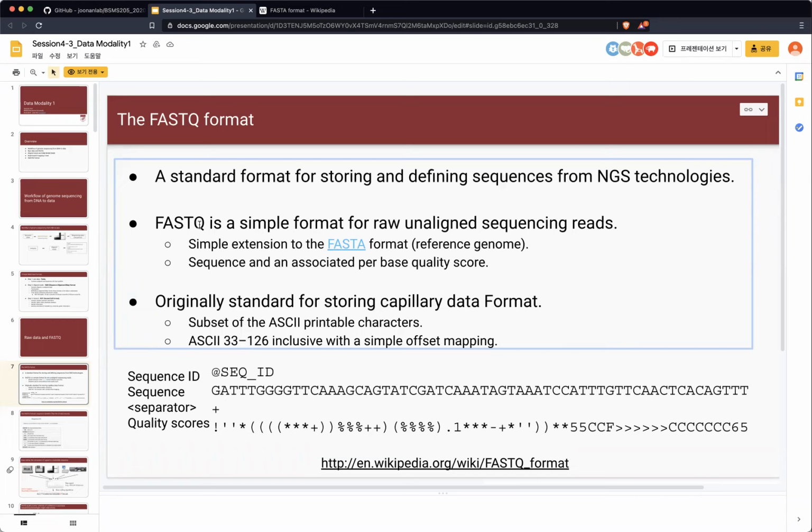coming to you because when you do the experiment, if you use the great technology from the latest days, your expectation is that the machine has to be perfect, right? But always your measurement has some error, right?